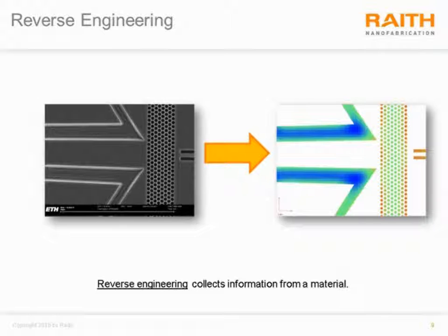Each layer can span a large area of about 1 centimeter squared. One layer must be very accurately aligned to the next layer in order to properly extract the design from the device. So over the past 15 years, reverse engineering scanning electron microscopy has been an enabler for applications such as intellectual property infringement, design verification for hardware cybersecurity, and also design recovery for hardware obsolescence.